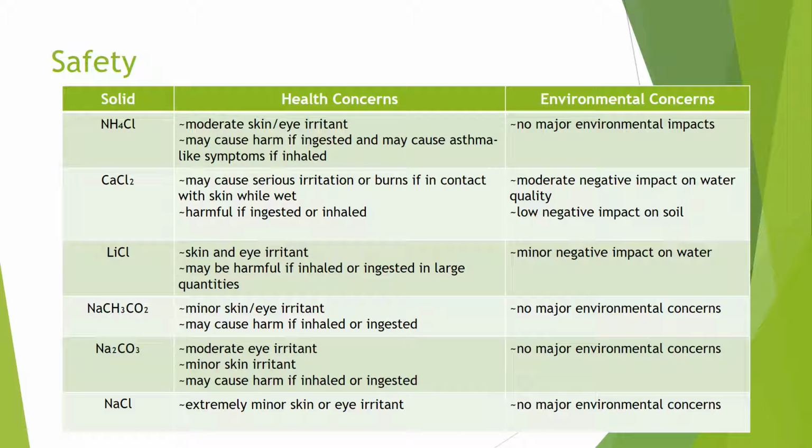The health concerns of sodium carbonate are that it is a moderate eye irritant, a minor skin irritant, and may cause harm if inhaled or ingested. There are no major environmental concerns of sodium carbonate. The health concerns of sodium chloride are that it is an extremely minor skin or eye irritant, and there are no major environmental concerns of sodium chloride.